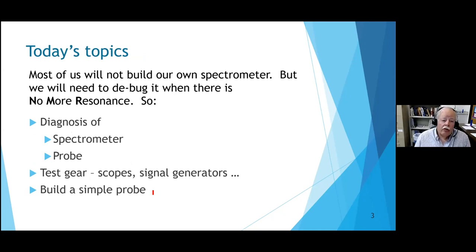Something in the publicity said 'building your own spectrometer.' No - most of us will never build our own spectrometer, but you'll sure need to debug it. We're going to talk about the diagnosis of the spectrometer and the probe, and that'll necessarily take us into test equipment: oscilloscopes, signal generators, vector network analyzers. And I'm going to devote some time to what you'd have to do to build a simple probe - I think it's terribly educational, and it's the one part of the spectrometer you can make custom.